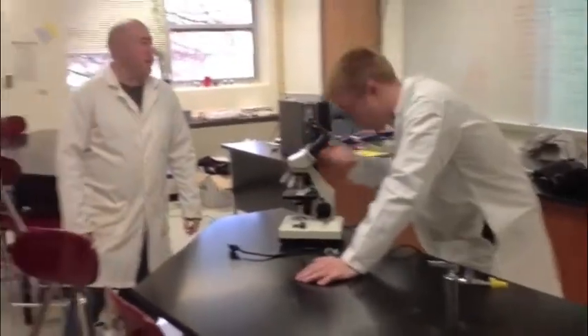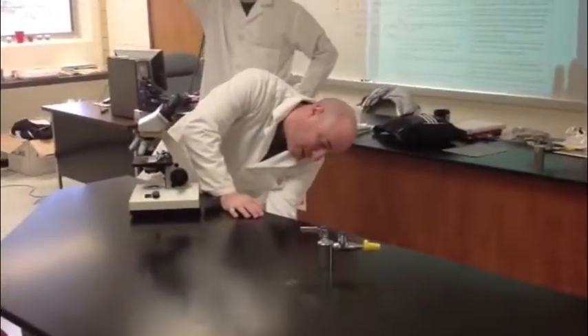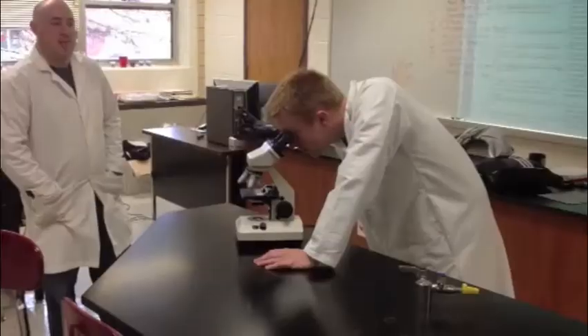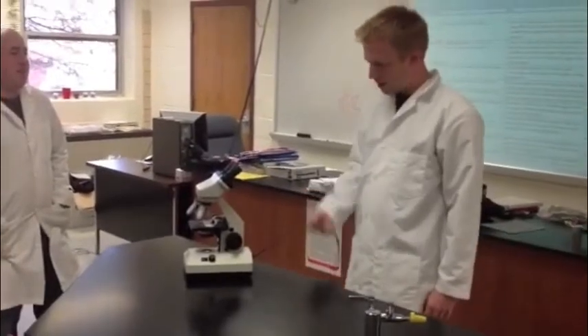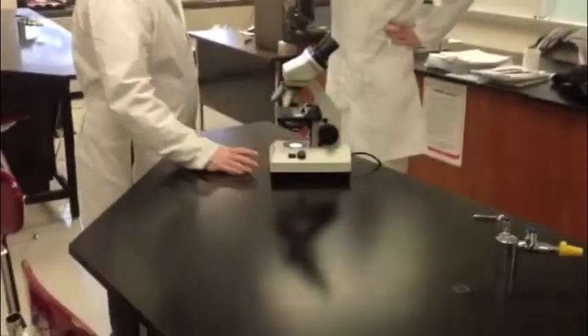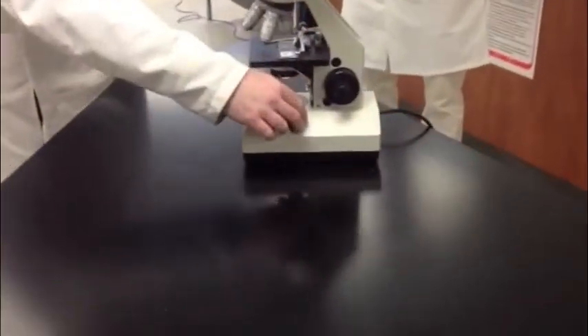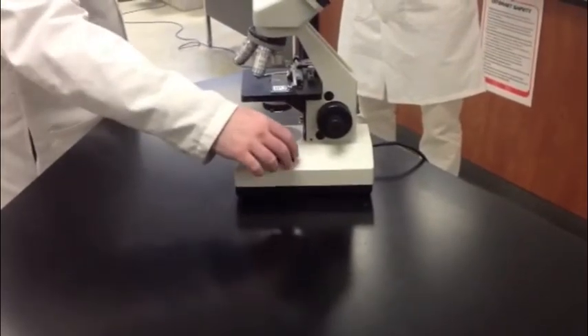Mr. Pepper, I can't see anything. The microscope is completely dark. Are you sure the microscope is plugged in? The first thing you always want to do is make sure that your microscope is actually plugged in. Most of our desks have these little plugs in them to plug the microscopes in. Mr. Pepper, my microscope is plugged in, but I still can't see anything. It's completely dark. Well, you've got to make sure that the light's turned on. This little switch turns it on and off, but if you use this other switch, it also adjusts how much light is there. So you want to make sure not only is it turned on, but that it's all the way up.